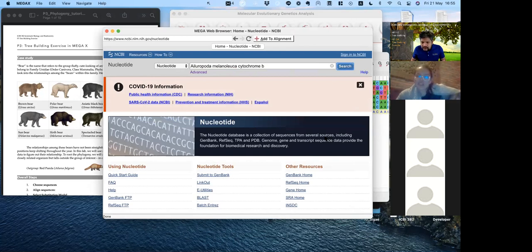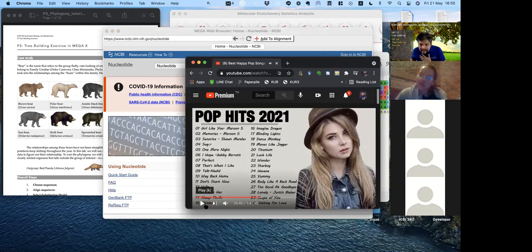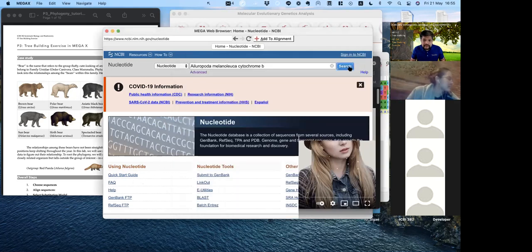I'm just wondering, in the text file, you don't put the number in, right? And is there any space between the gene and the starting number? You use a hard return for a different line? I mean, when you copy the gene sequence, do you copy the number too? No, just the ATCG. Okay.